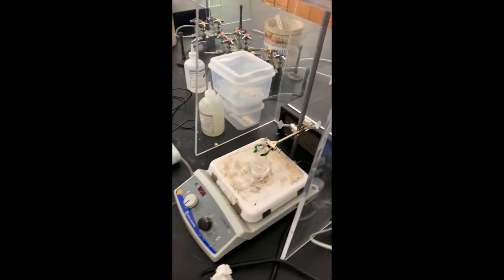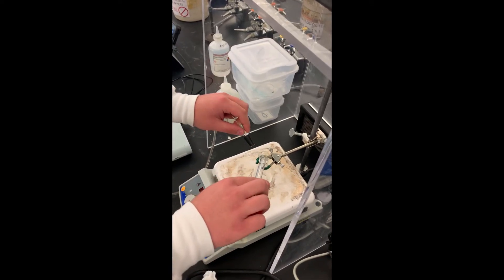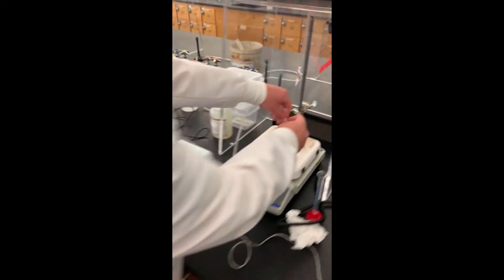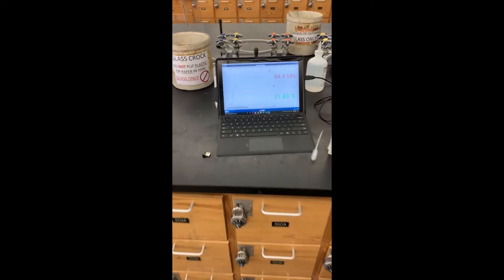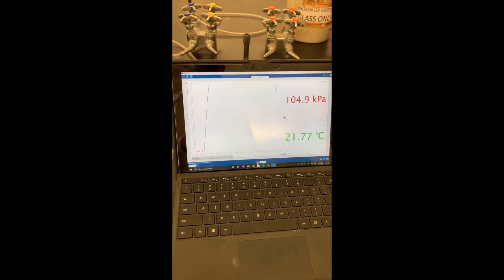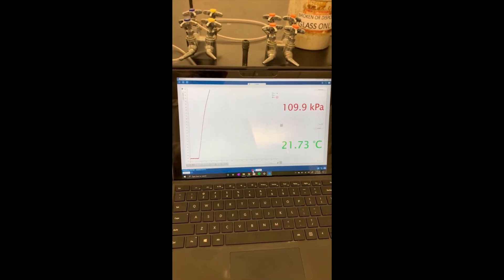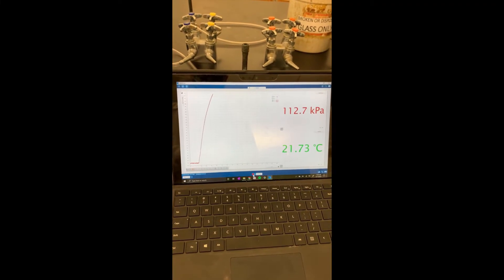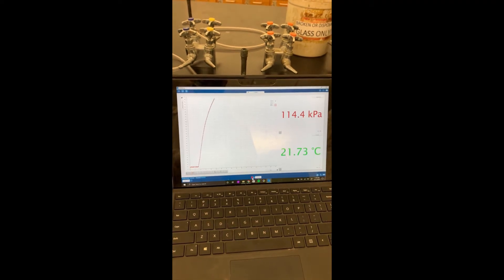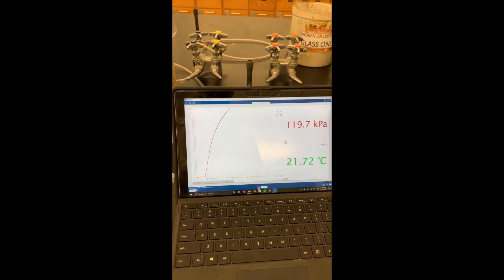As you can see, we're already quite a bit past where we were before with our pressure. Sometimes the stopper pops off at this point. So let's see how far we get.